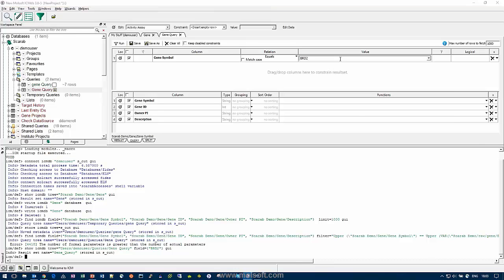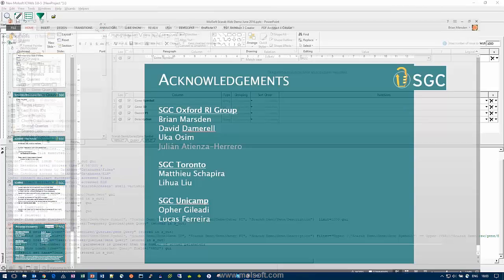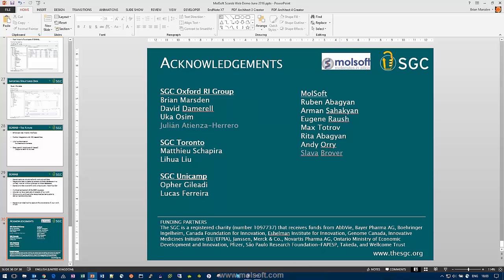Can other databases, i.e. non-chemistry drug databases, be connected? Is it possible to be used for biology and chemistry departments, collaborative projects? It depends upon what the database is and whether they'll open it up to you and what the schema of the database is as well. All Scarab can do is be pointed to a database and it will learn what it can from how that database has been written, what its schema is, how it's been designed.